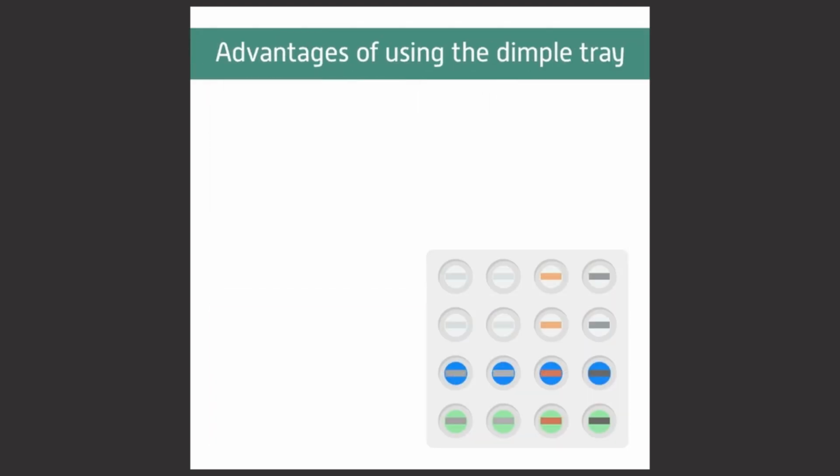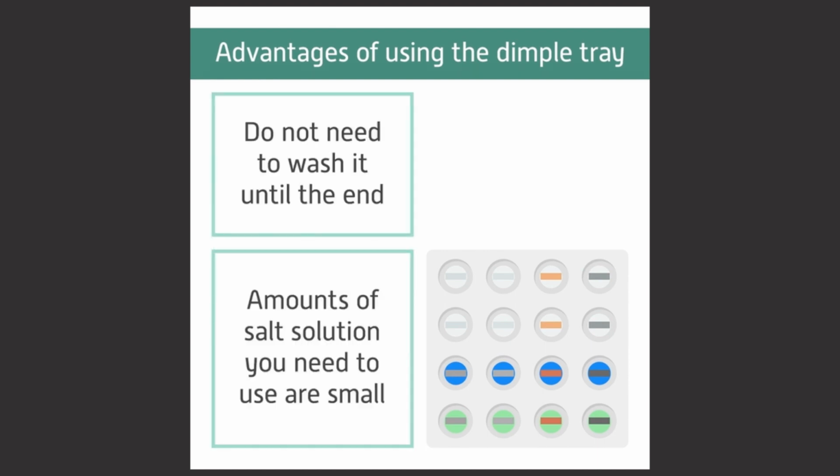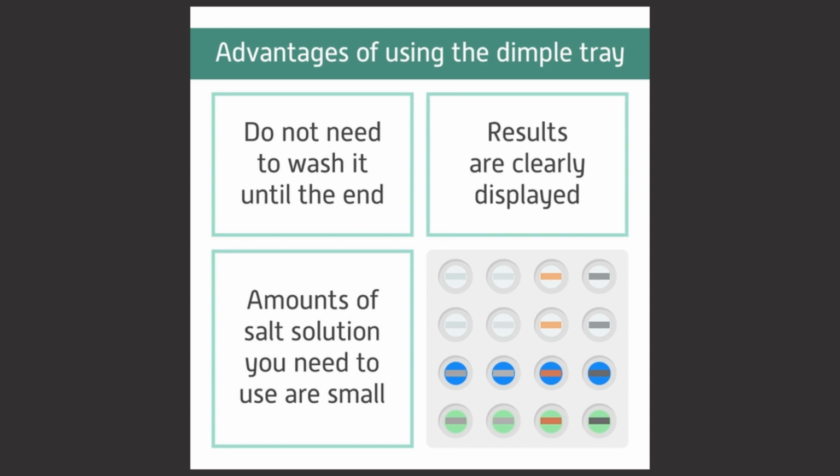However, the advantages of using the dimple tray is that you do not need to wash it until the end, the amounts of salt solution you need to use are small, and the results are clearly displayed.